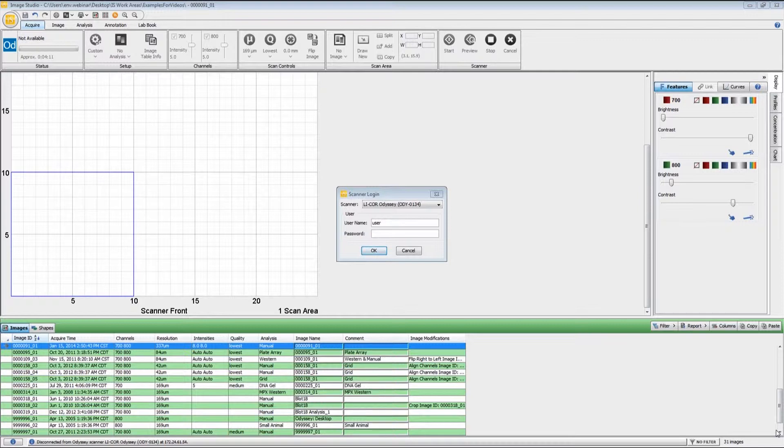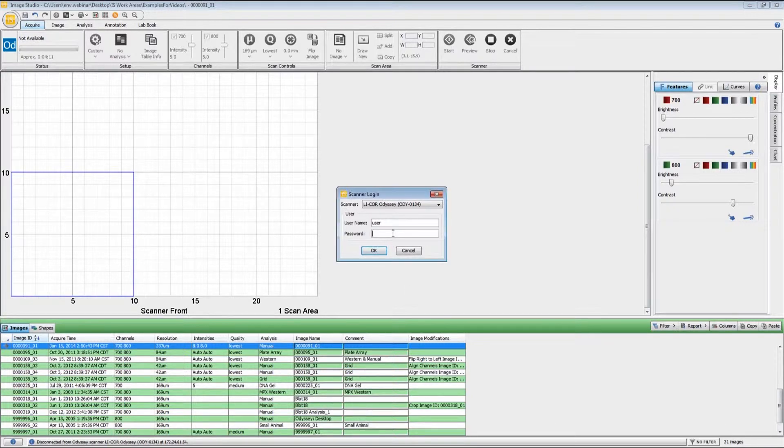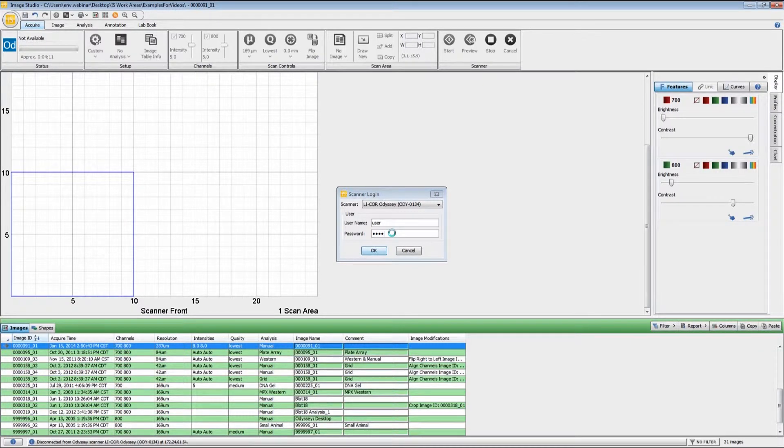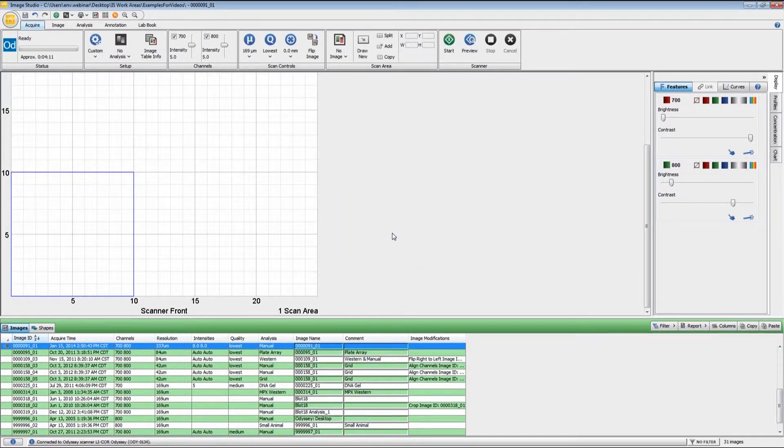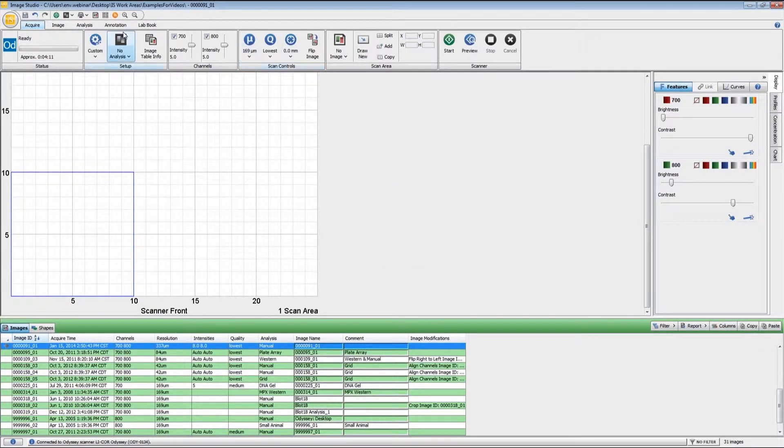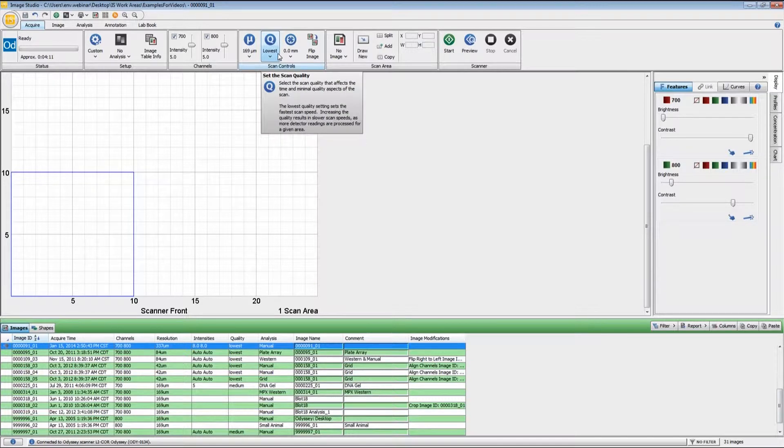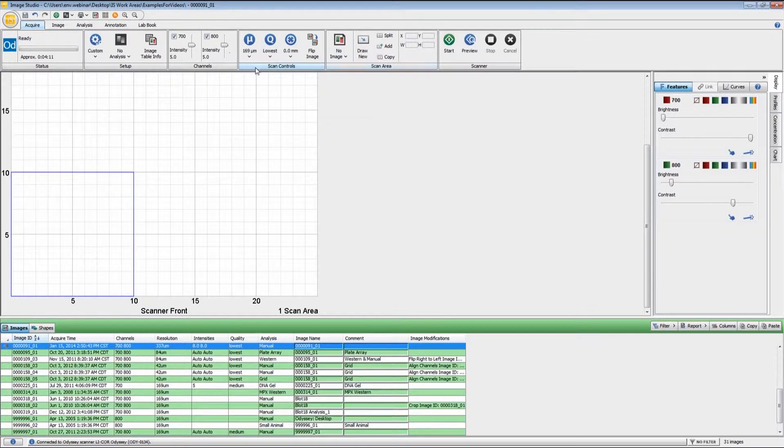When you open up Image Studio, it should try to make a connection with the instrument. You enter in your username and password and press OK. Once that connection has been established, the buttons here on the Acquire ribbon will become active.